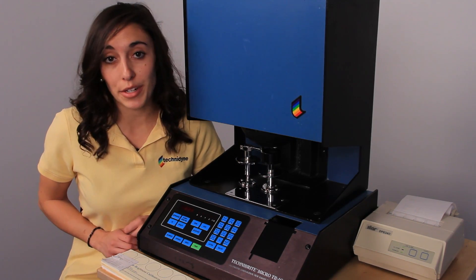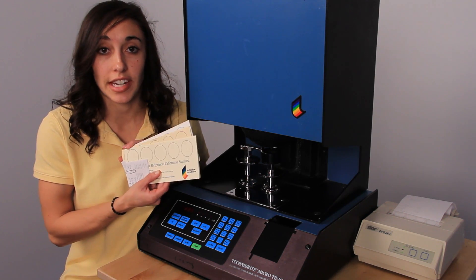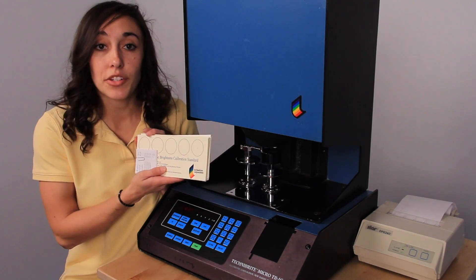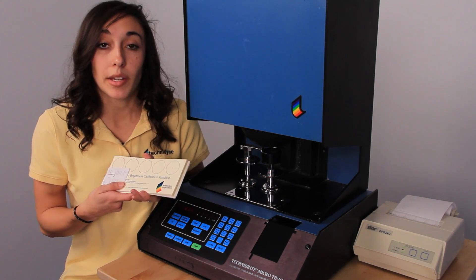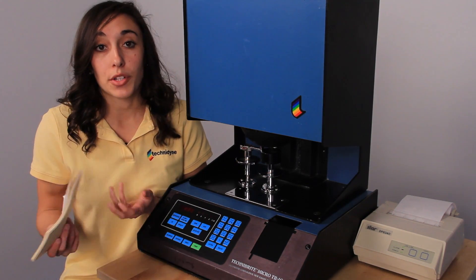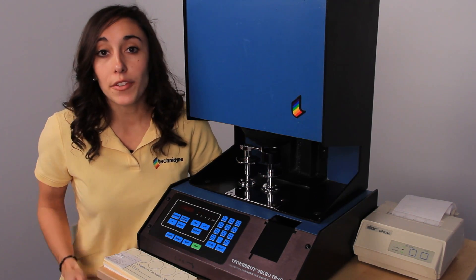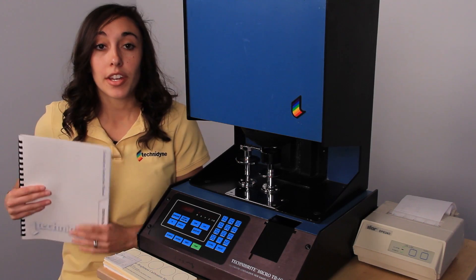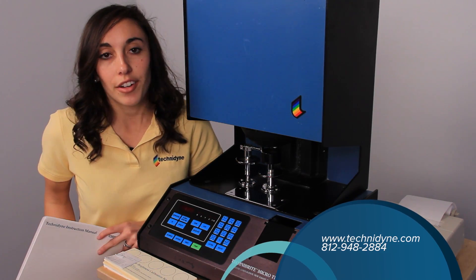Finally, in order to verify measurement linearity, you'll take the last four sets of verification standards and measure each of the five positions. You'll take the average of those five positions and compare it with the average on the printout. If those numbers are within plus or minus 0.3 of each other, then that's great. If they're not, or if you have any questions, you can refer to your Technidyne Operator's Manual, call Technidyne, or check out the website.